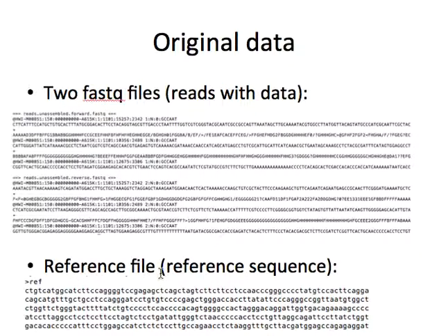And then the other part is the reference file, which is a very small text file in this case, with the sequence of the loci that we are trying to modify.